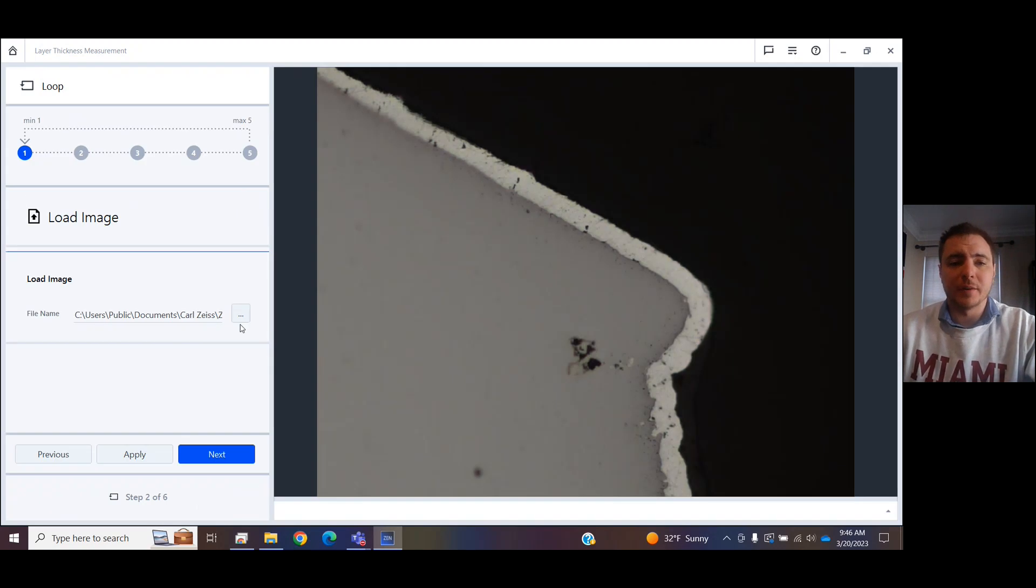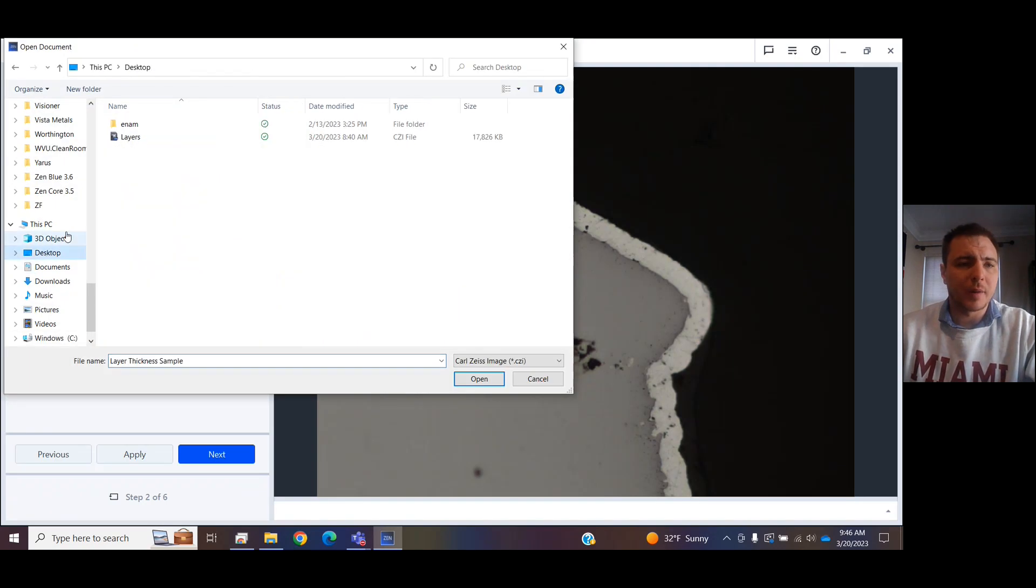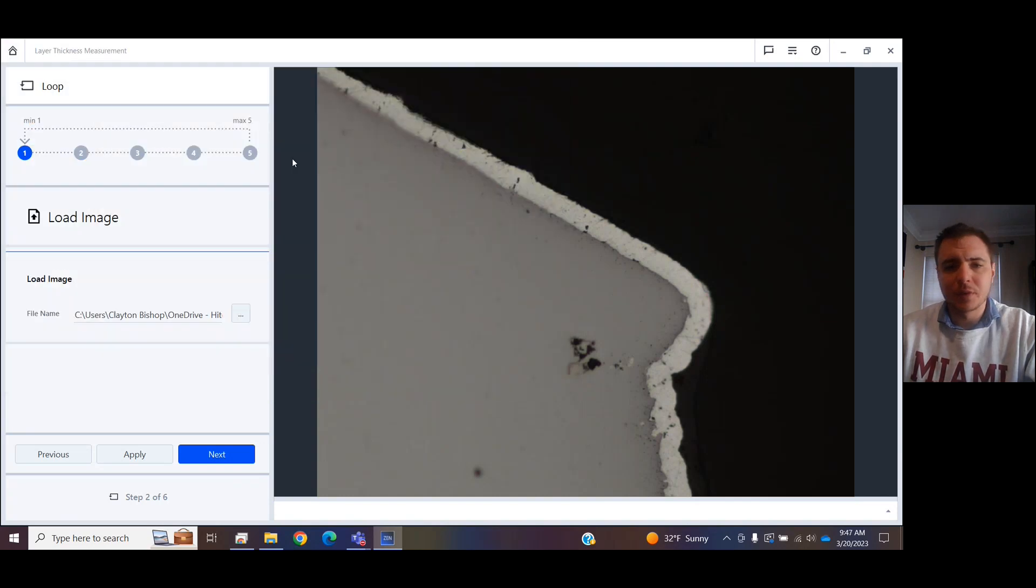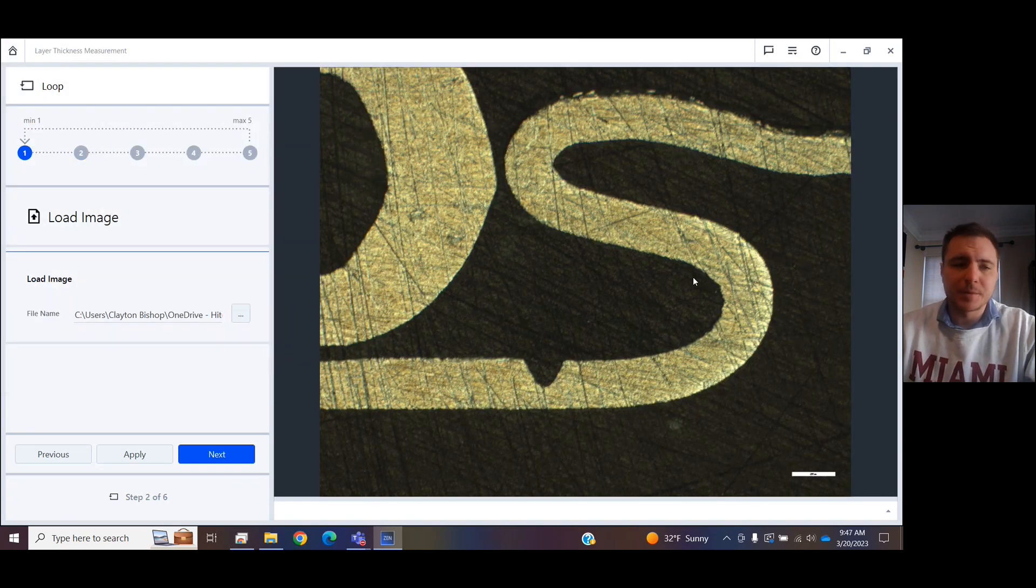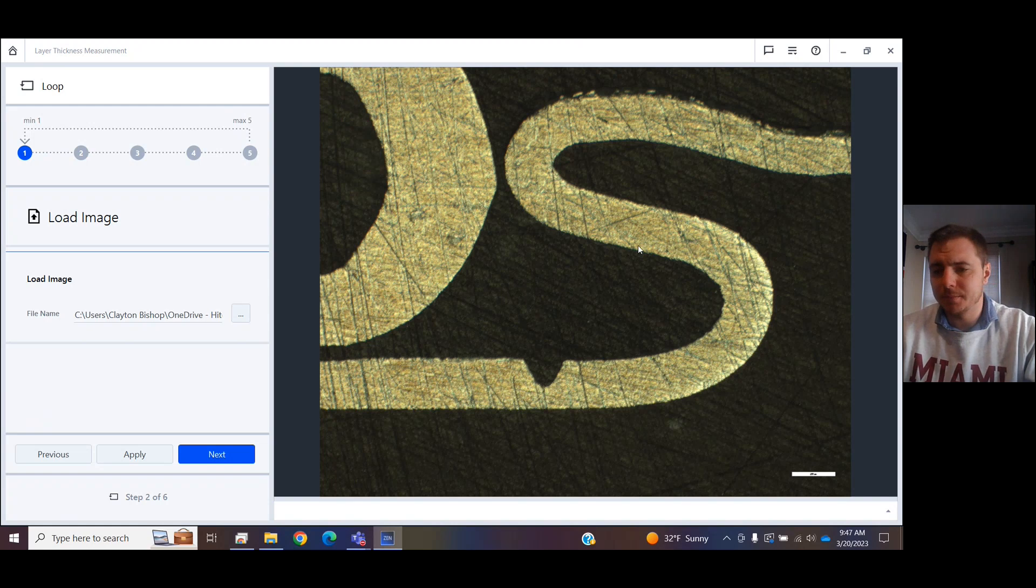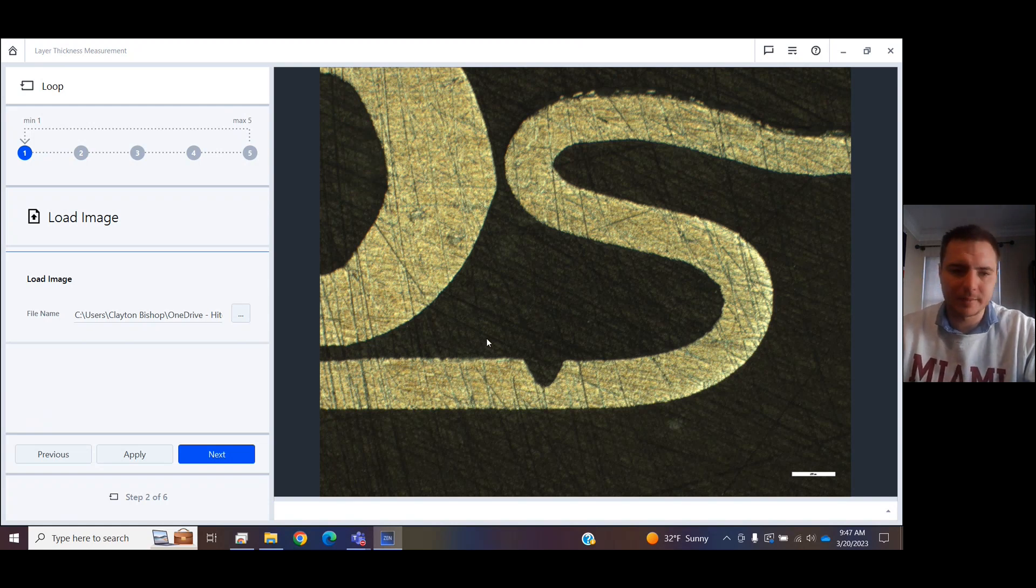Next step, you're going to find your image. I have one on here that I wanted to use right here. You can pick whichever image you want to do this with. It's necessary that you do have calibration data for it so that we can actually take measurements.